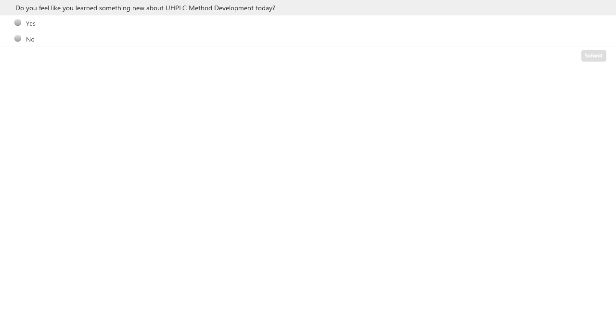Someone asks whether you need to consider dwell volume for the isocratic method. No, not really at all. The only slight difference may be the peak shape if you have a lot of extra volume in the system, but for isocratic methods, it's not really a concern. We do measure the dwell volume on all of our systems during the annual maintenance, even if they're for isocratic runs, but I wouldn't anticipate that we needed that value really, no.